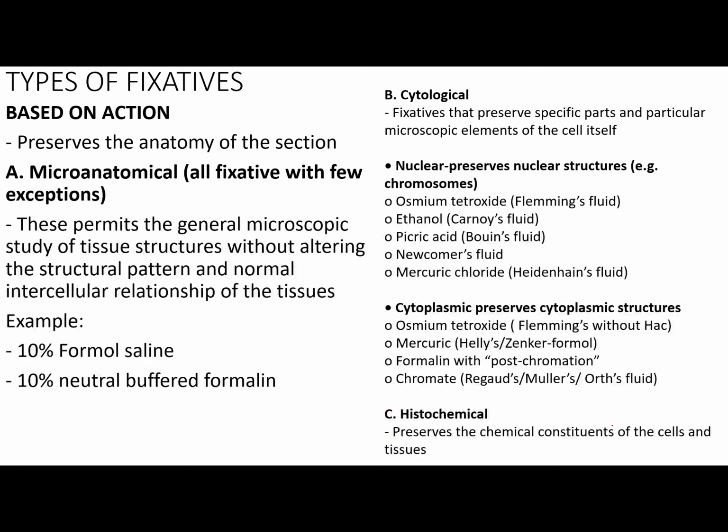The first one is based on action. Pag sinabi mong based on action, it preserves the anatomy of the section. Now under based on action, we have your microanatomical. Now microanatomical basically covers all fixatives except for a few exceptions. Now, sa microanatomical class, this permits the general microscopic study of tissue structure without altering the structural pattern and normal intercellular relationship of the tissue.